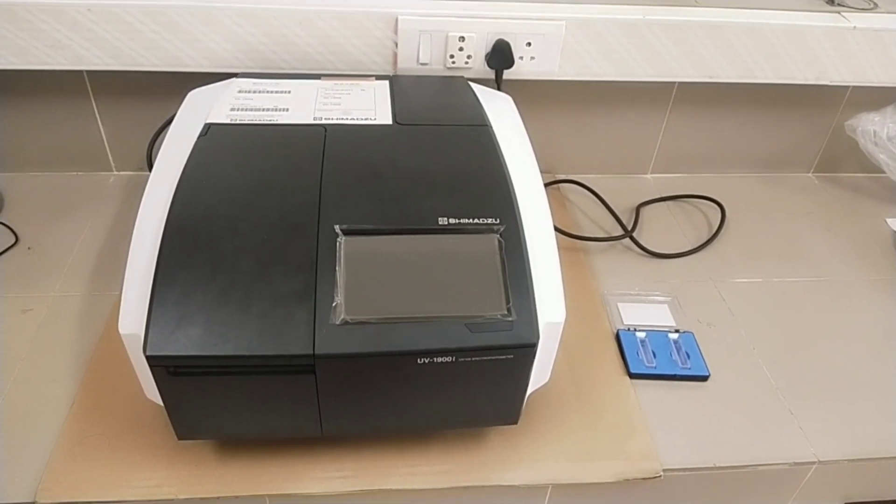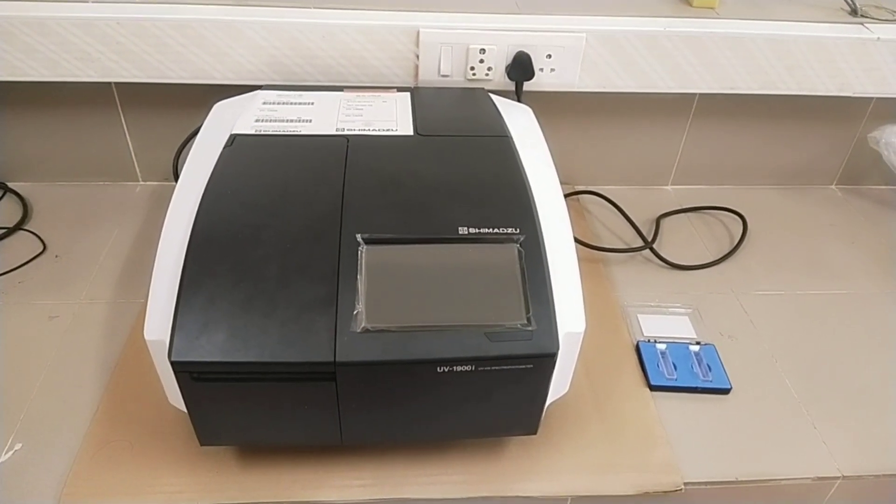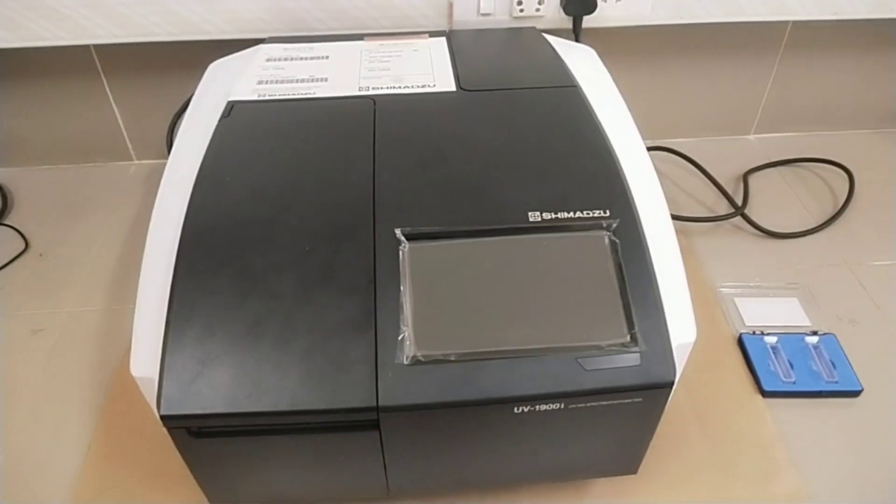It is a dual beam UV visible spectrophotometer. Internal parts consist of an inbuilt light source — a 20W halogen lamp and a deuterium lamp. Monochromator holographic gratings. Detector is a silicon photodiode.